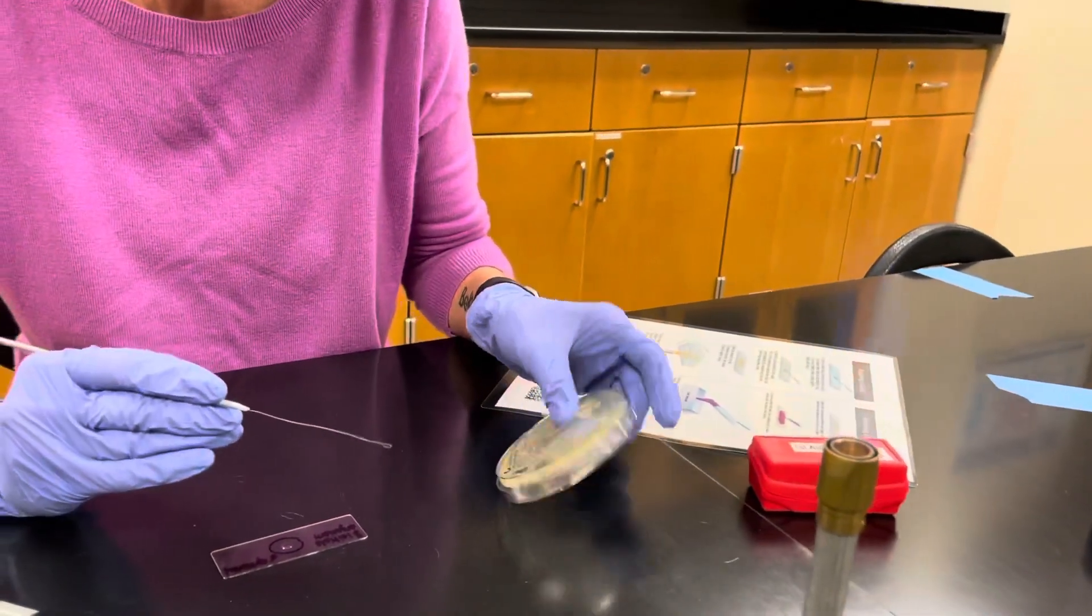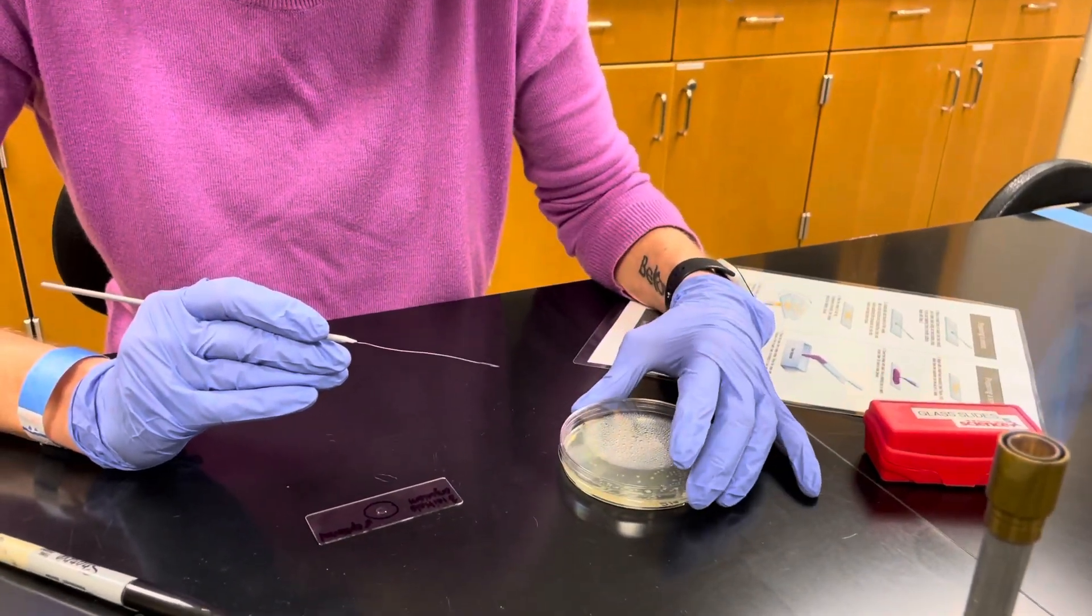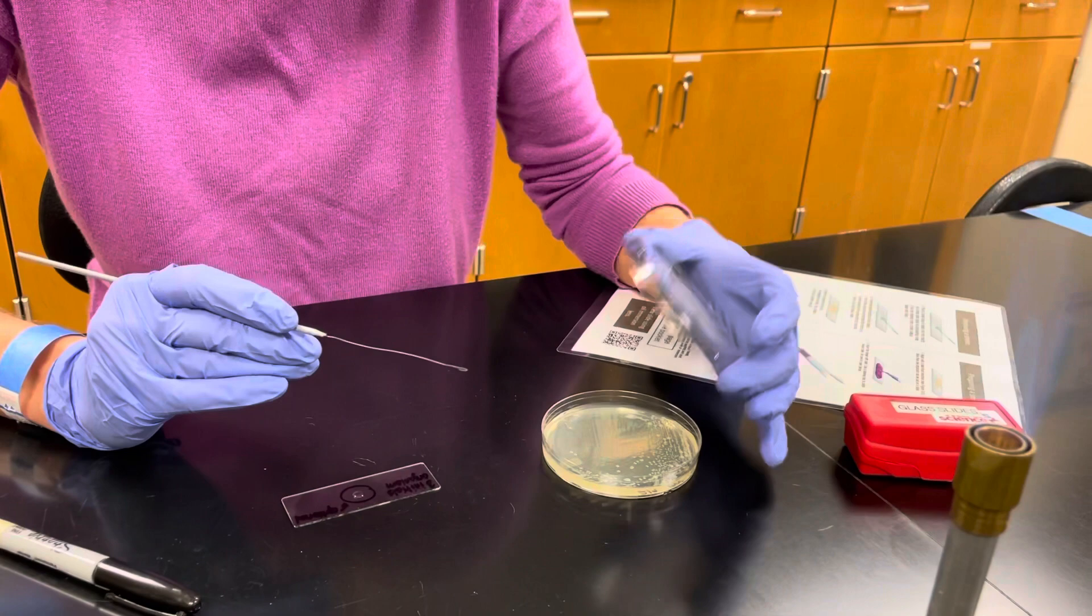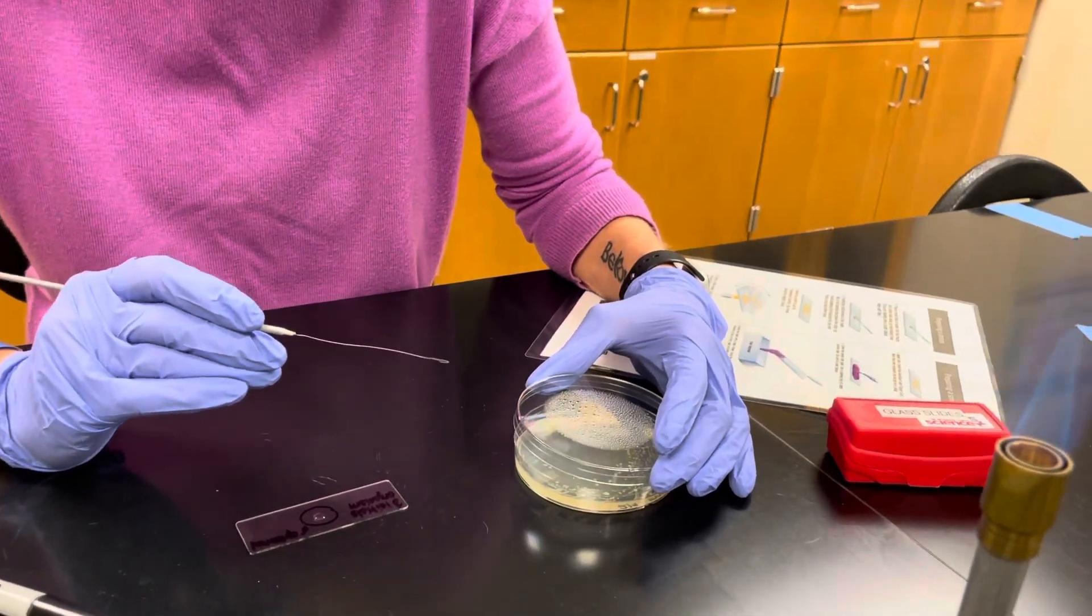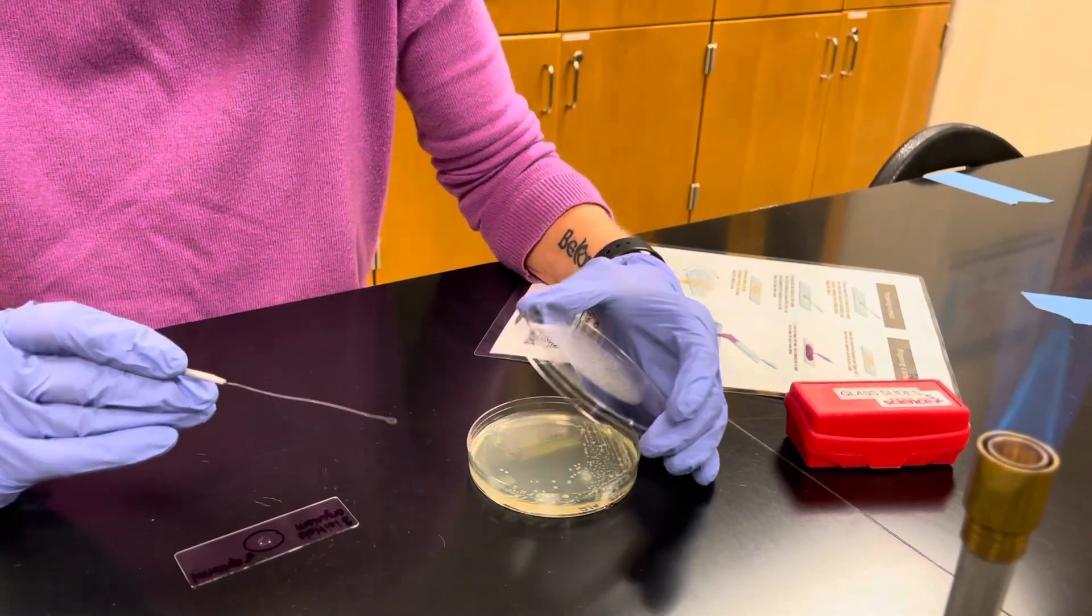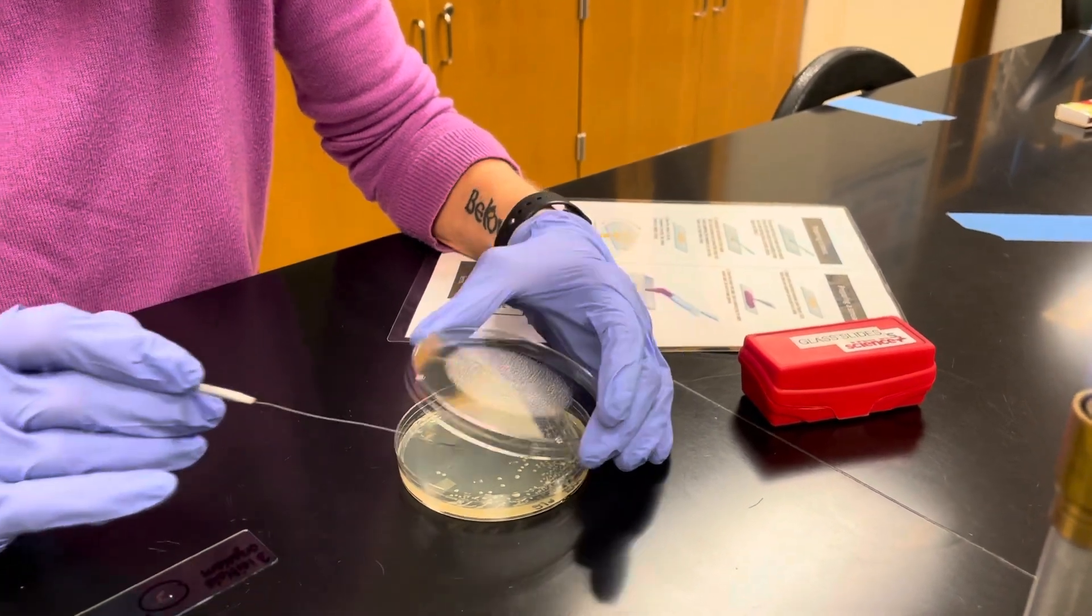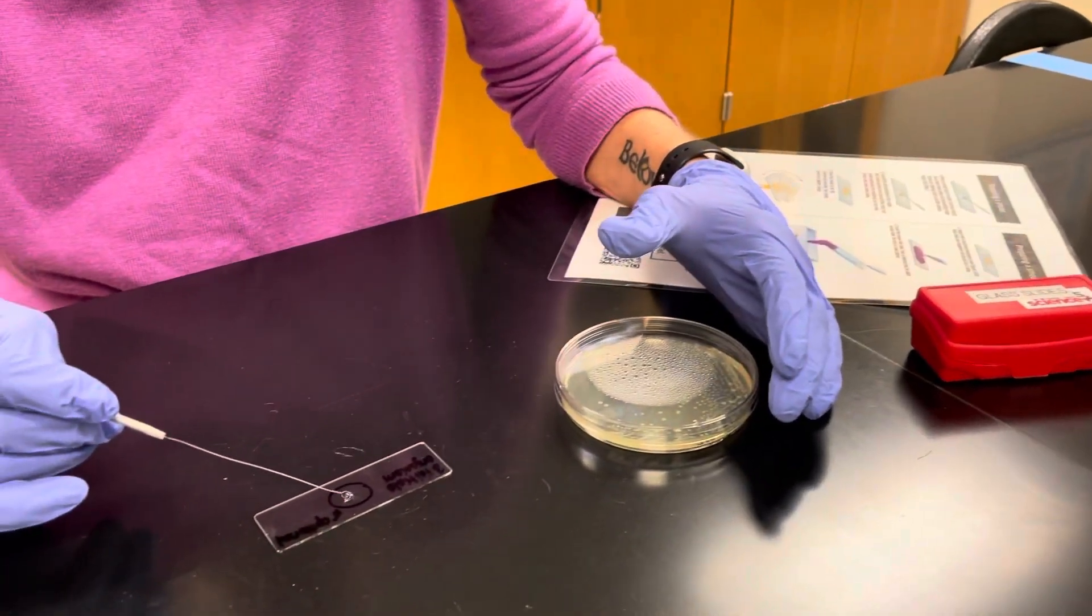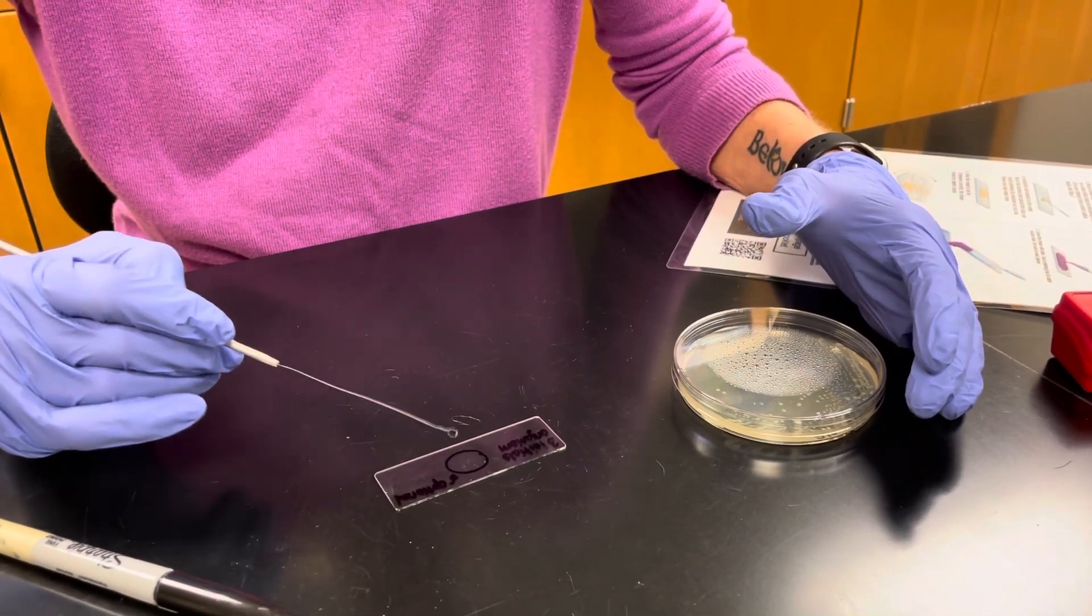And then we're going to go into our plate. We want to do this aseptically, so you use the lid as a shield. You never take the lid off and sit it on the lab bench. And we want to take the youngest cells. So you always take those from the edge of the colony. If your colony is very small, you can take the whole colony. So I'm going to take the edge of this colony and I'm going to stir that into that small drop of water and spread that out.